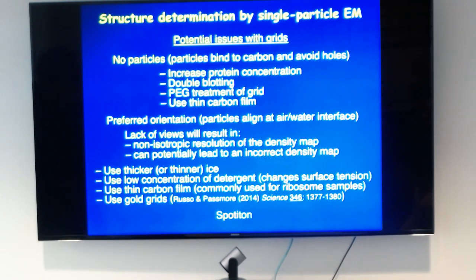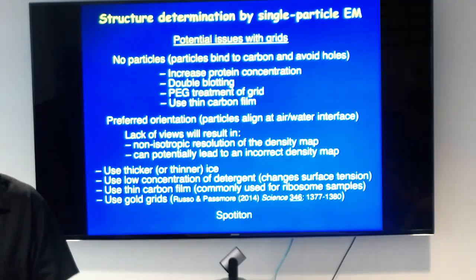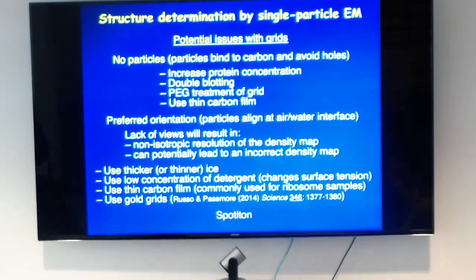A lot of this is just if you get a good grid, you just collect on it, and we don't ask why anymore. You have samples that do daisy chaining, and you do occasionally have samples that don't, even from the same brand, the same tube. Ice thickness varies, but you'll see it make these little stacks that look like a little snake.